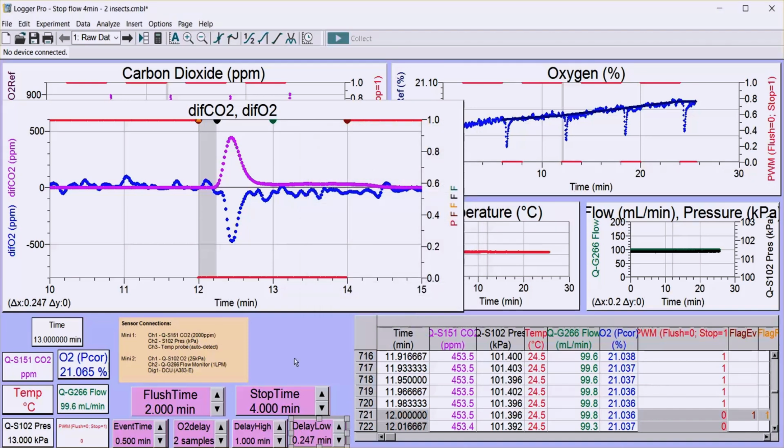The next parameter is the delay high. Oh, and by the way, with the delay low, you can see that once it's set, the marker, which is a black dot on the graph, is what marks the start of the delay low, or the peak for integration. And as we've changed this parameter, the black dot lined up with it. So now we're setting up the delay high.